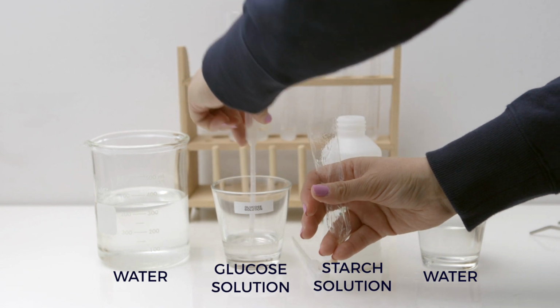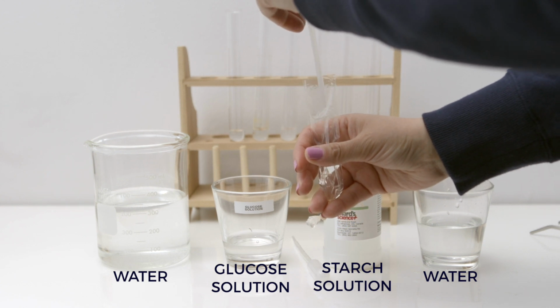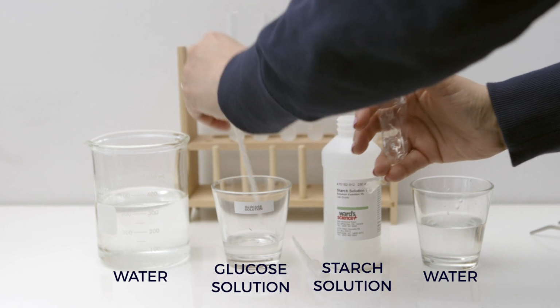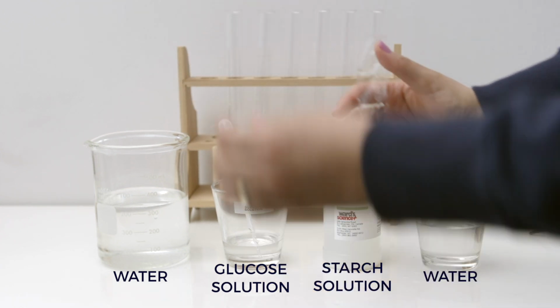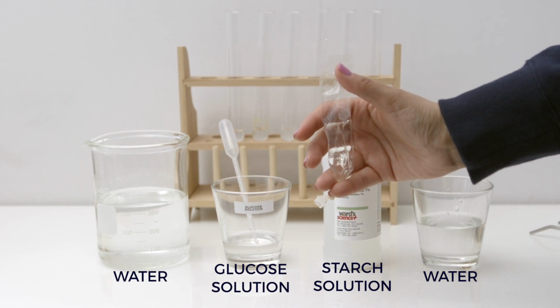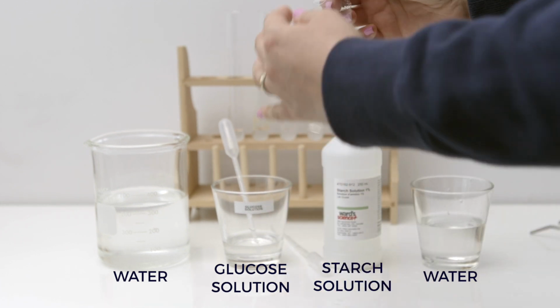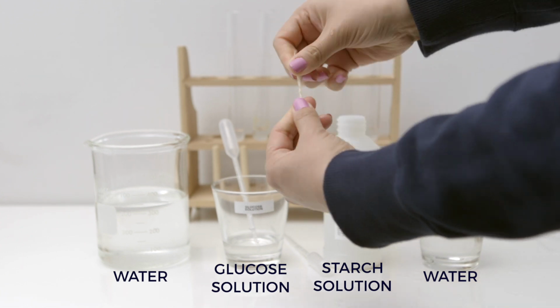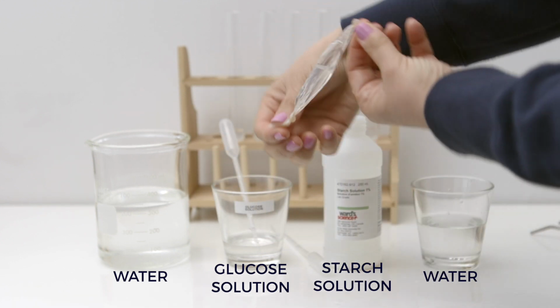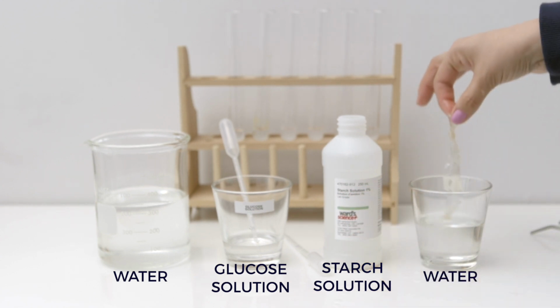Place a full pipette of the glucose solution into the tubing, followed by a full pipette of the starch solution. Tie off this open end and mix the solutions. Dip the model cell into the cup of water to clean the outside of the cell from any residue.